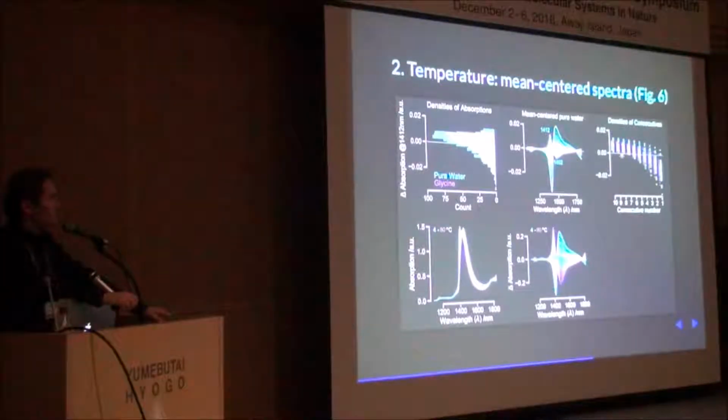So most of the first few consecutives are negative, and the higher we go in the consecutives, we're getting accumulation, and here we have the largest part of the later consecutives generating positive values. So what are positive and negative values? Here is the answer.